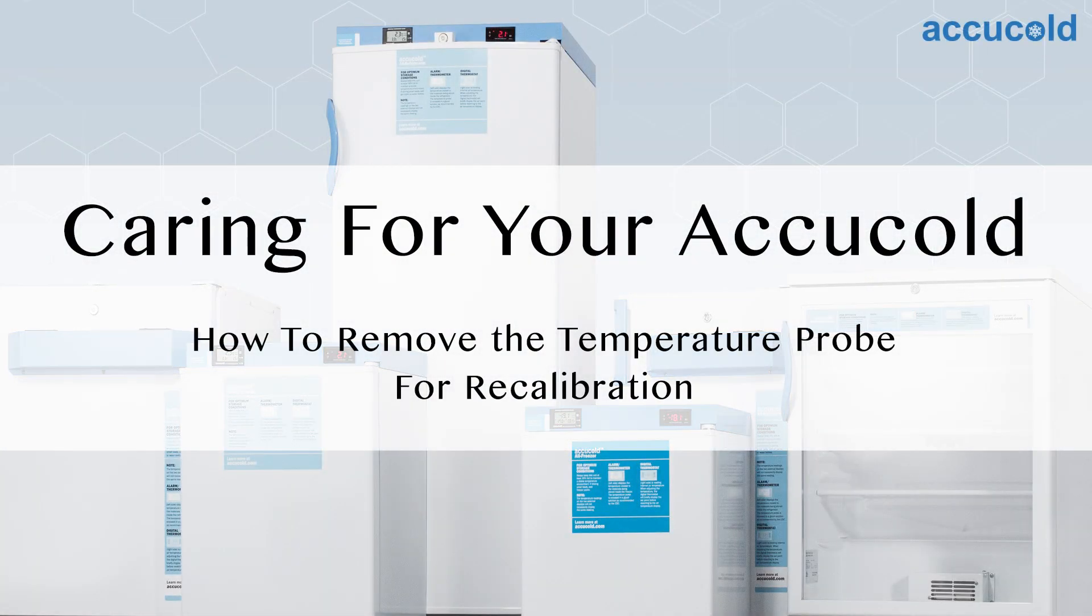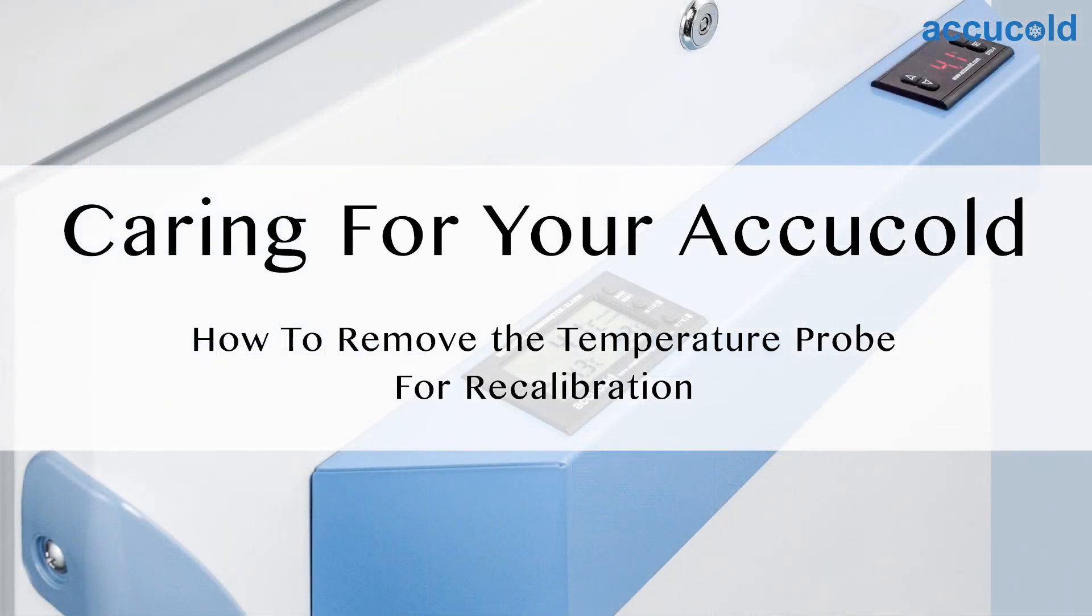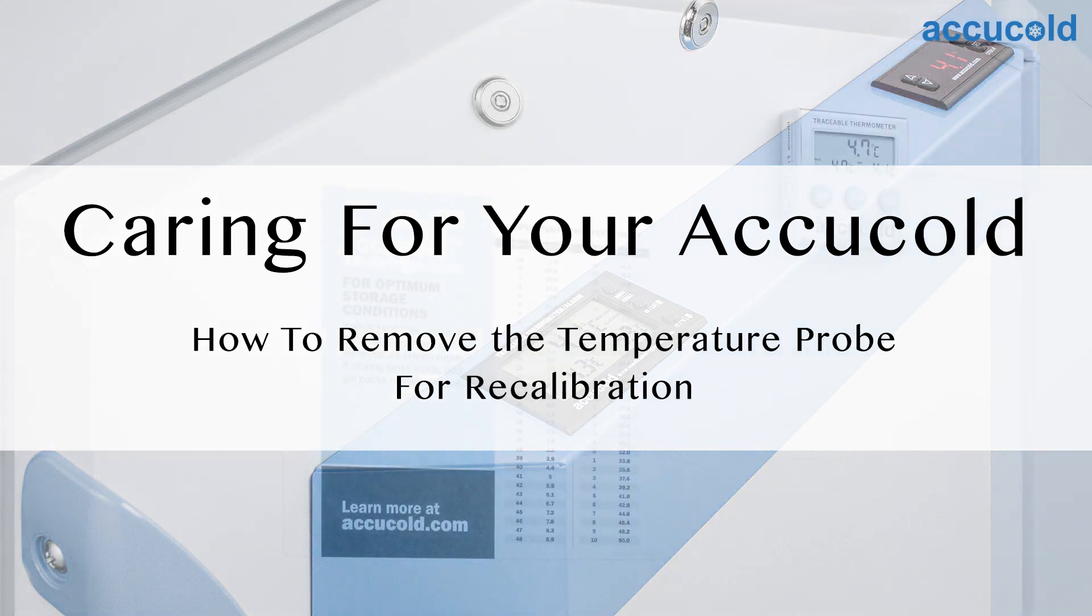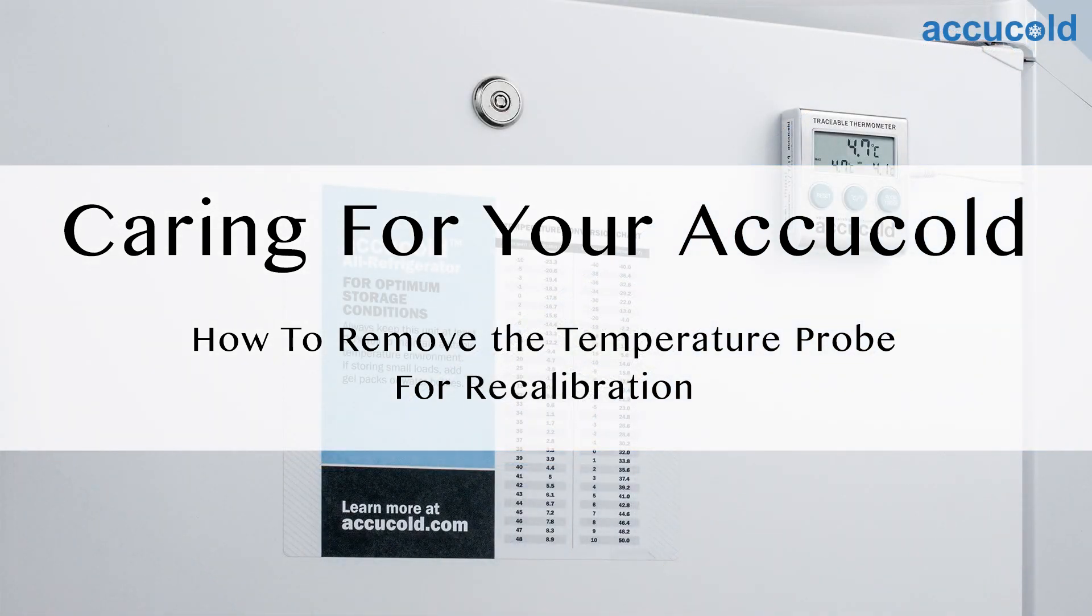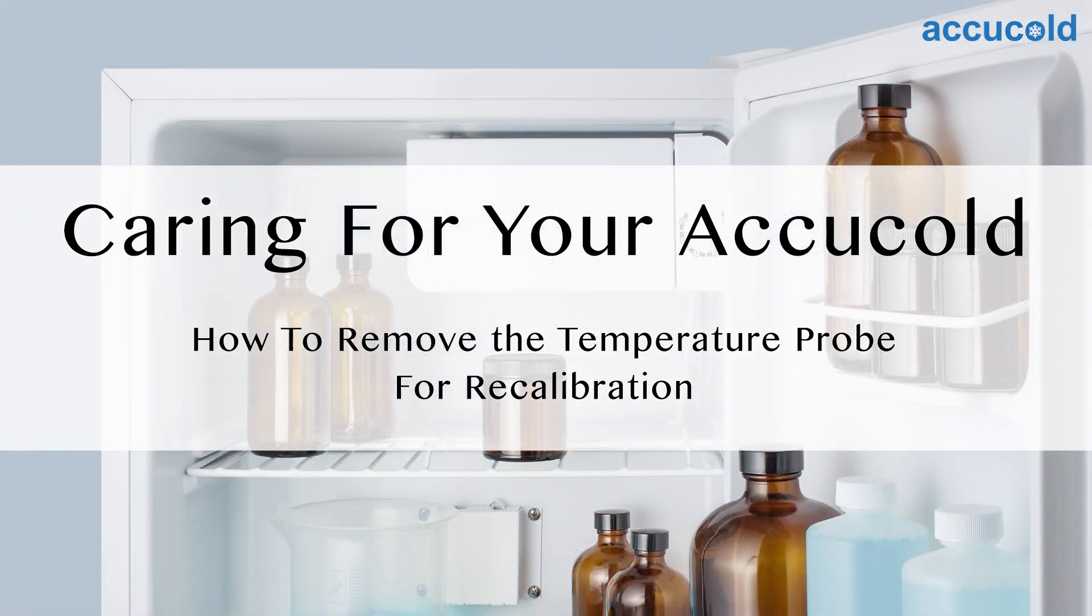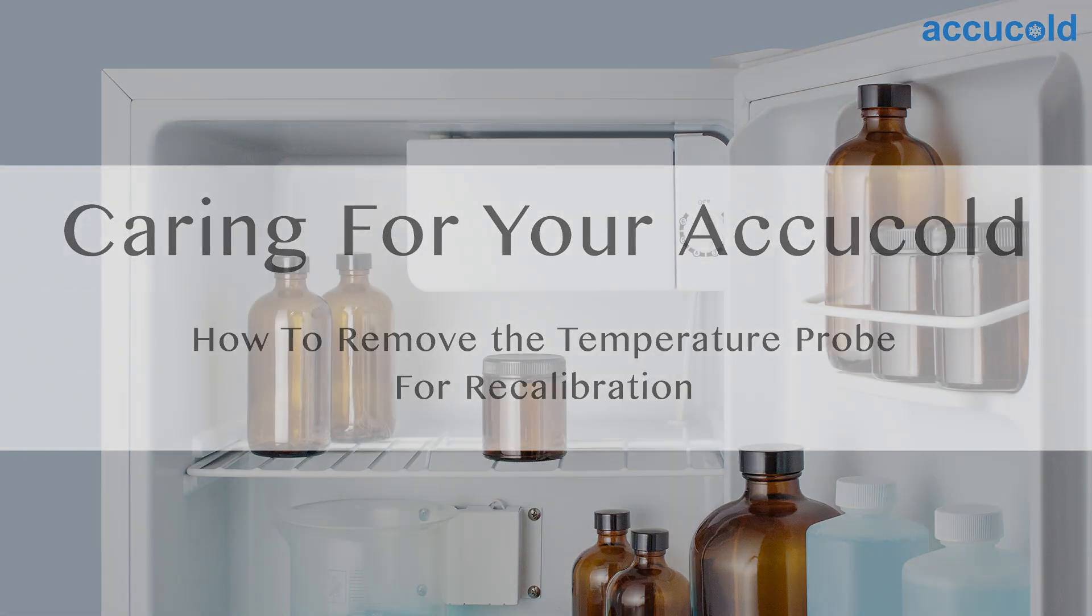AccuCold is committed to ensuring the highest level of quality and accuracy for temperature reporting. Our ISO IEC certified laboratory offers recalibration to NIST standards, allowing your monitoring device to maintain optimum results. This video will walk you through the steps of safely disconnecting your device for the recalibration process.